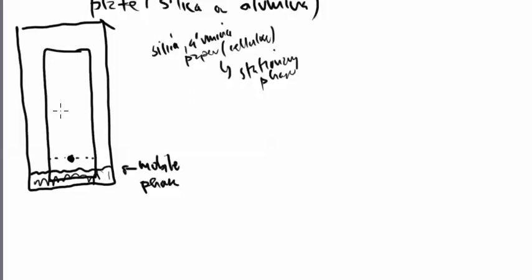So mobile phase is getting sucked up, and the stationary phase is kind of there as a foundation in a way to give these amino acids some traction so that they can begin to move. Okay, so what happens is that over a course of time, we see this mobile phase being sucked up the plate. So what I'm going to do is draw an arrow, and the arrow will be right here. And we will see mobile phase going up, up, up, up, up the TLC plate.